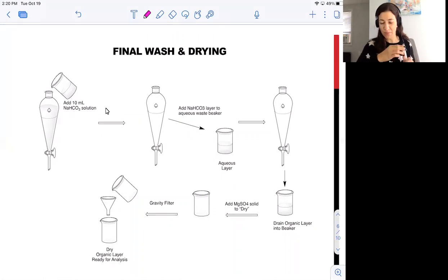The final step of preparing the product for analysis is known as drying. This is a bit of a deceptive term. We're not actually going to dry away all of the liquid so that our sample is no longer wet. We're going to instead add magnesium sulfate, which is a white powdery solid. It acts as a desiccant and is able to adsorb all of the water that's in solution. This will get rid of any tiny water droplets that are remaining in your organic layer.